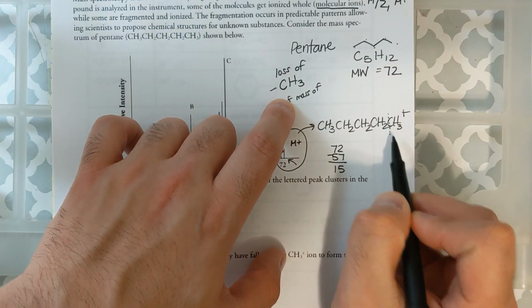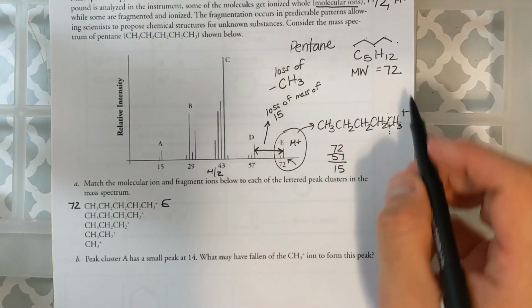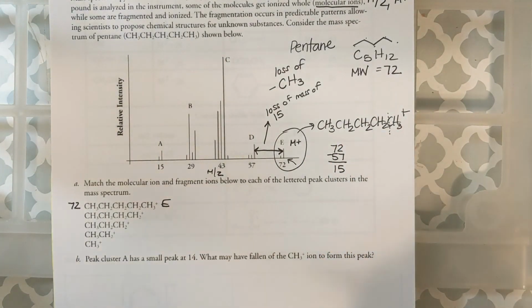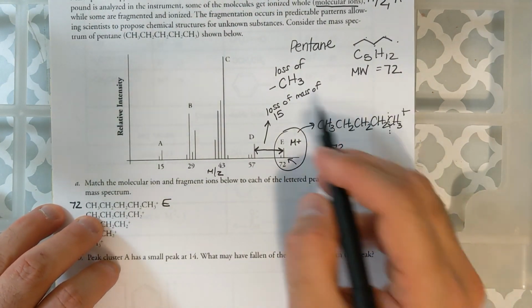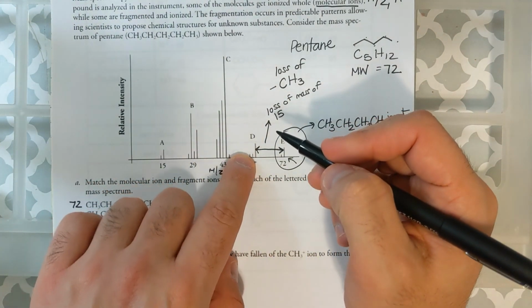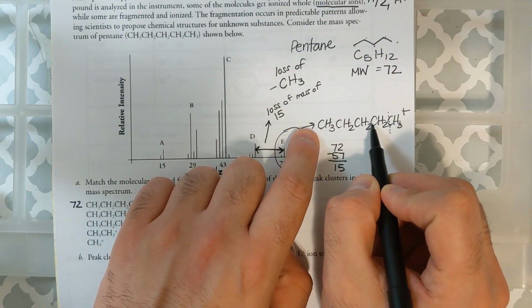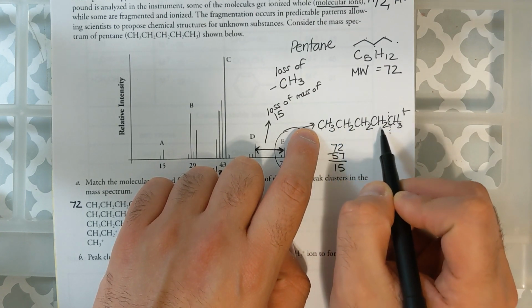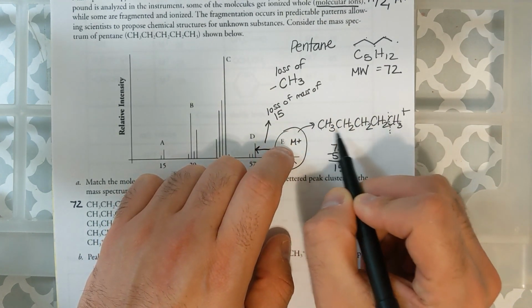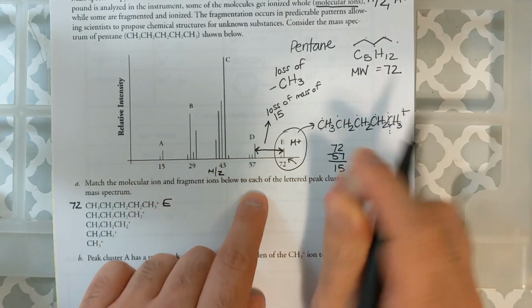That means we could probably cut off this ending here. It doesn't matter which one, but I must have lost a CH3, which means I'd be left with the rest of these carbons at peak D, which would have a mass of 57. 1, 2, 3, 4 is 48. 49, 50, 51, 52, 53, 54, 55, 56, 57. So these 4 carbons right here must have a mass of 57.